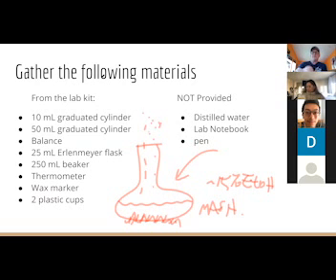What do I do with the fumes? If I just boil it, the fumes are just going to go everywhere and I'm just going to be left with nothing. So I have to do something with those fumes. What do I do with them? To hold them in another container. So I transfer these to another container, right?